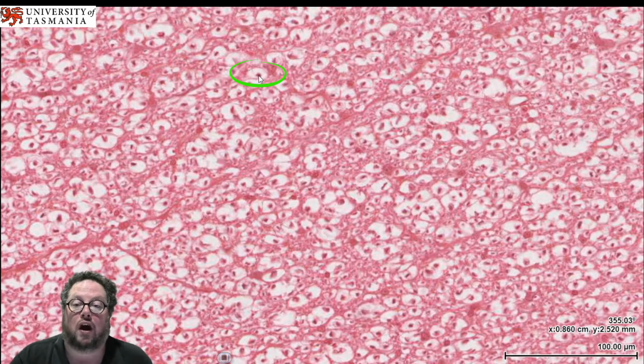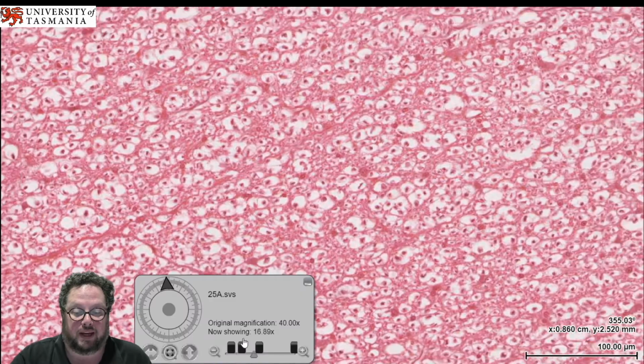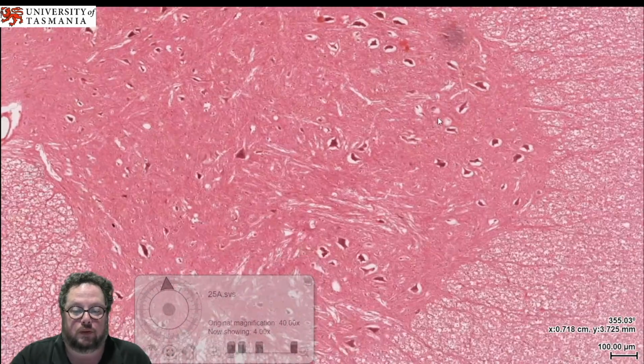Now the dots are actually the axons. They contain neurofilaments and neurotubules, which are proteins, and proteins stain with eosin. So that's why we have these little acidophilic dots here. These white spaces are where the myelin sheath used to be. It's been removed through processing for microscopy, and those are basically wrappings of the oligodendrocytes. And they, of course, form these conducting tubes that enable the action potential to jump down the axon through saltatory conduction.